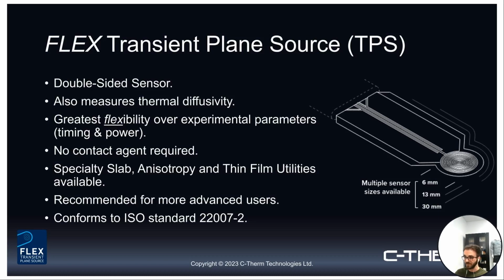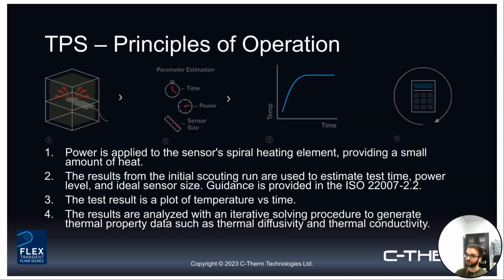we'll discuss. The TPS, I will flag just at a high level, is a little bit more complex from an operational standpoint. So we do really recommend it for more advanced users. But of course, if it is something that is of interest, the training we can provide on this will of course get you set up and running and comfortable with using the instrument. Last note, it does conform to the ISO standard 22007-2, something to potentially take a look at if this is a method of interest to you.